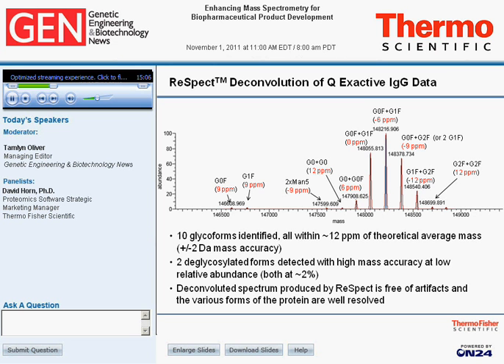And what happens is all the charge states for a given component from the previous spectrum are collapsed into a single peak at the mass, the average mass value of that protein in the spectrum.